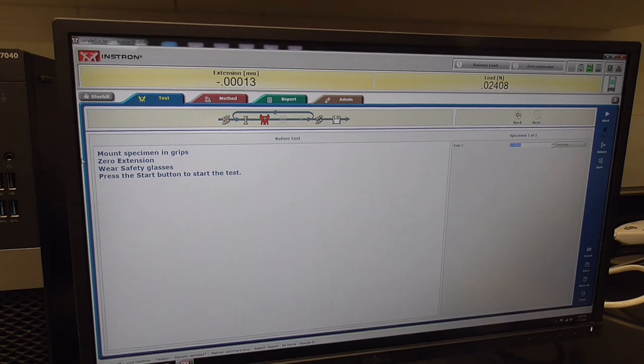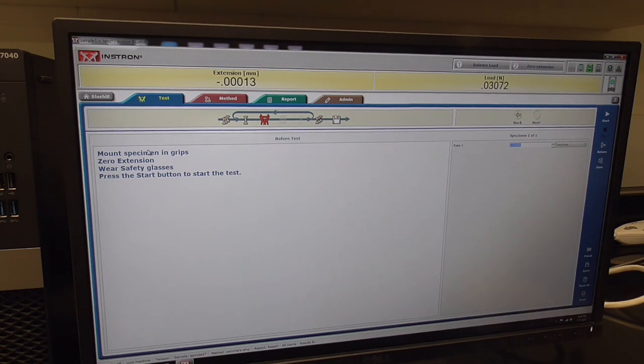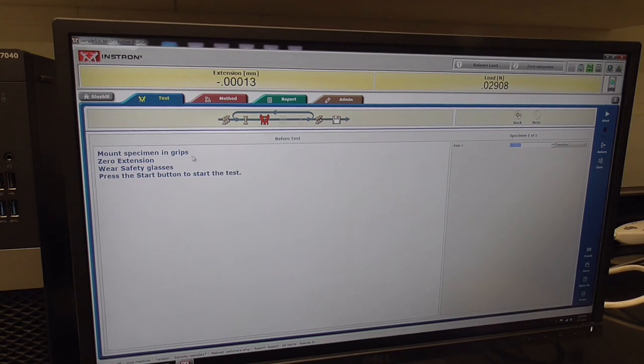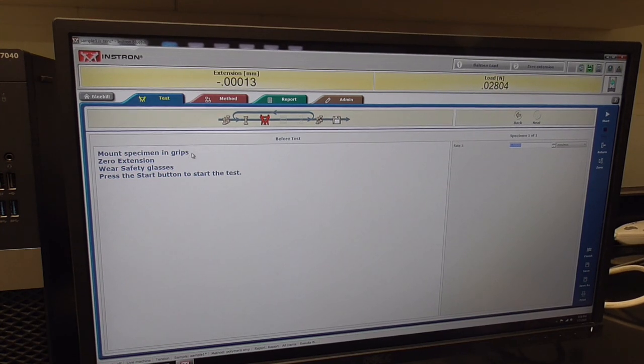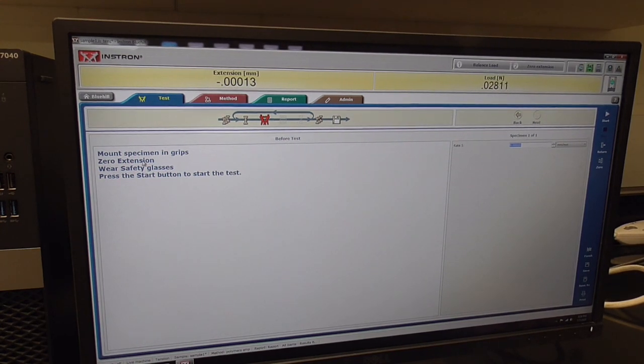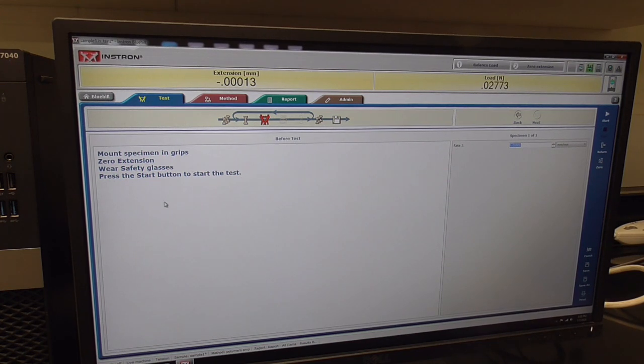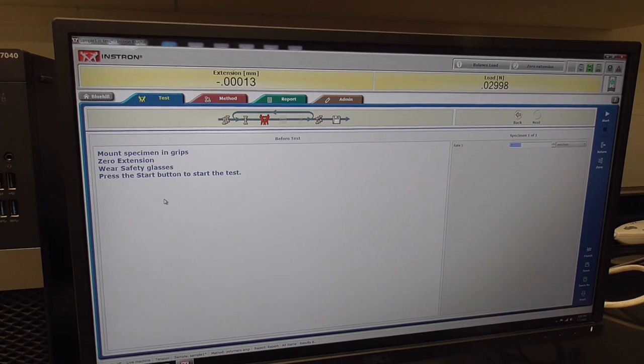This is the screen just before the test, and you have some warnings on here. Mount your sample in the grips, zero the extension, wear safety glasses, and then you're ready to start the test. So let's mount the dog bone in the grips.